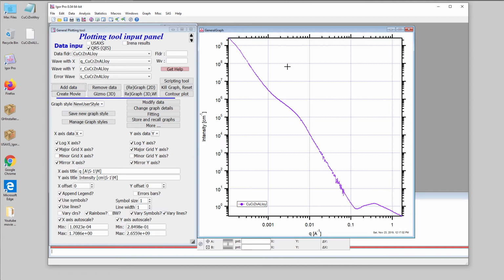This is quite common for alloys. Alloys are a pain because they have these grains, they have grain boundaries, they have possibly some other features in them. And so they scatter all around the place. And therefore, it is very difficult to study weak scatterers, weak components of the microstructure in alloys.